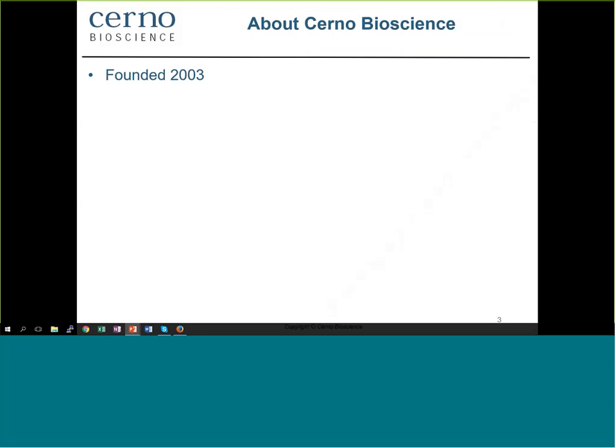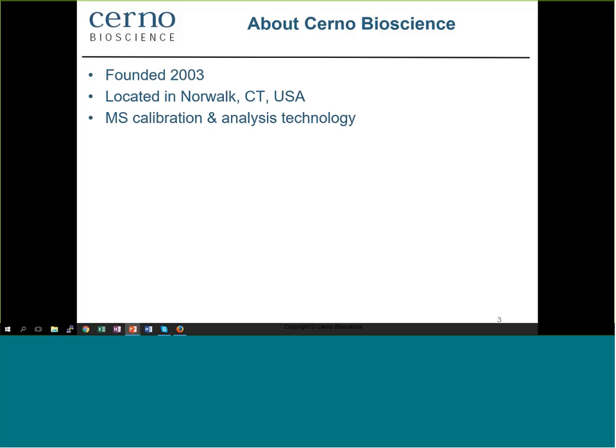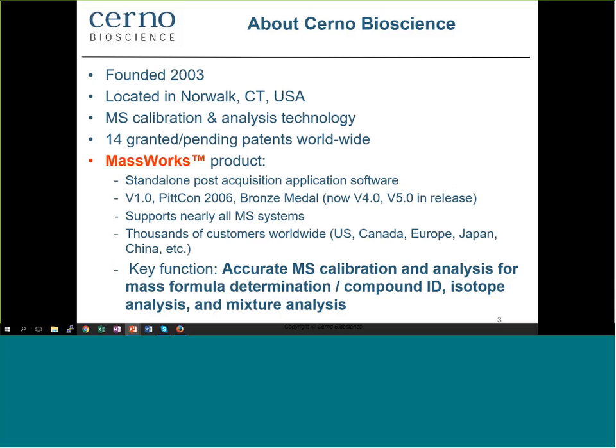I'm just going to spend a brief moment to give you a little background on our company. Cerno Bioscience was founded in 2003, so we've actually been around for quite some time now. Our headquarters are located in Norwalk, Connecticut, in the United States, and we specialize in mass spec calibration and analysis technology. The company has over 14 granted and pending patents worldwide covering this unique technology. We make our applications and calibration technology available through a product called MassWorks. MassWorks is a standalone post-acquisition application software.